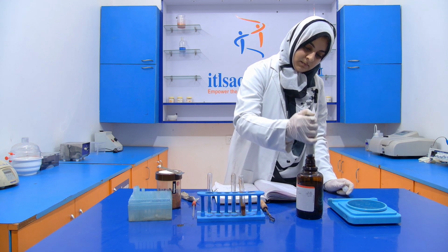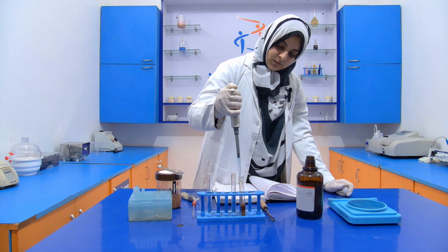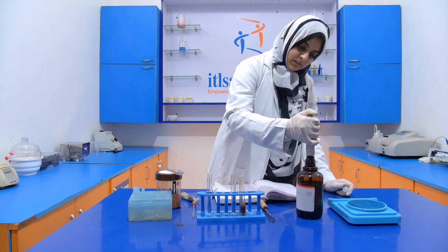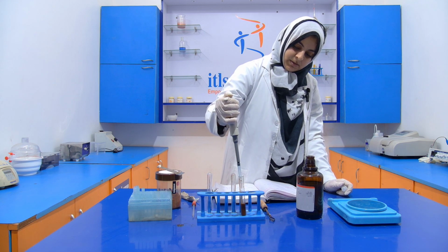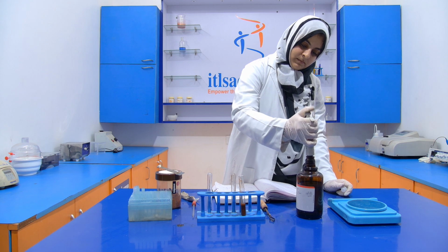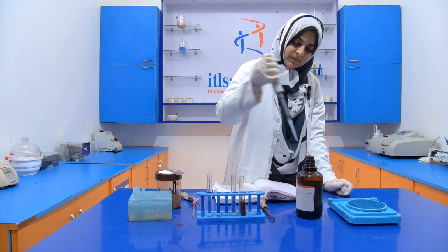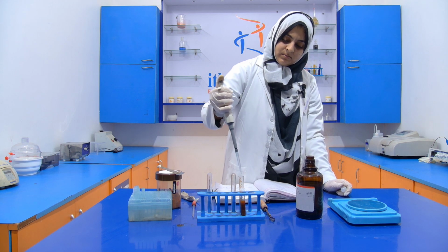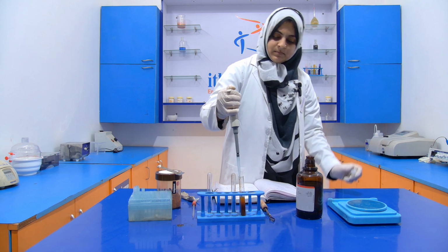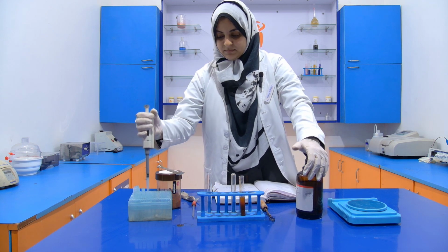1, 2, 3. We have to take it 5 times because our micropipette is 1000 microliter. Okay, then it is 5 ml.